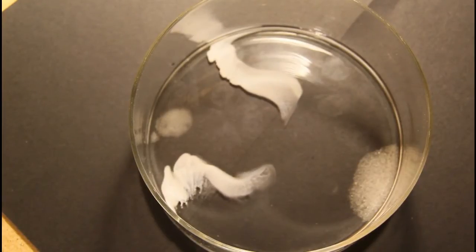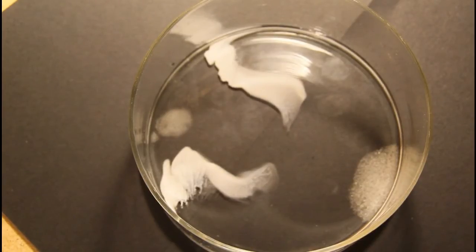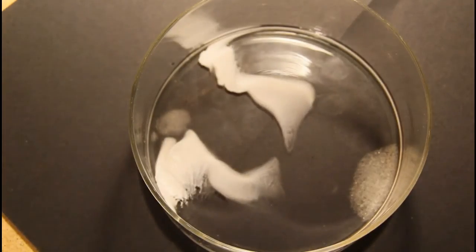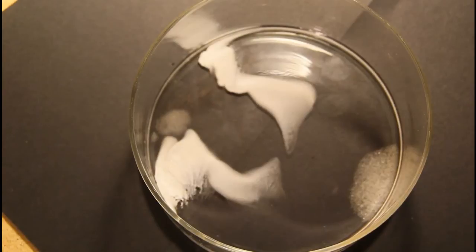And so what happens is the silver ions are coming into contact with the chloride ions and silver chloride is precipitating out. You can see it's forming a precipitate. And that's a precipitation reaction.